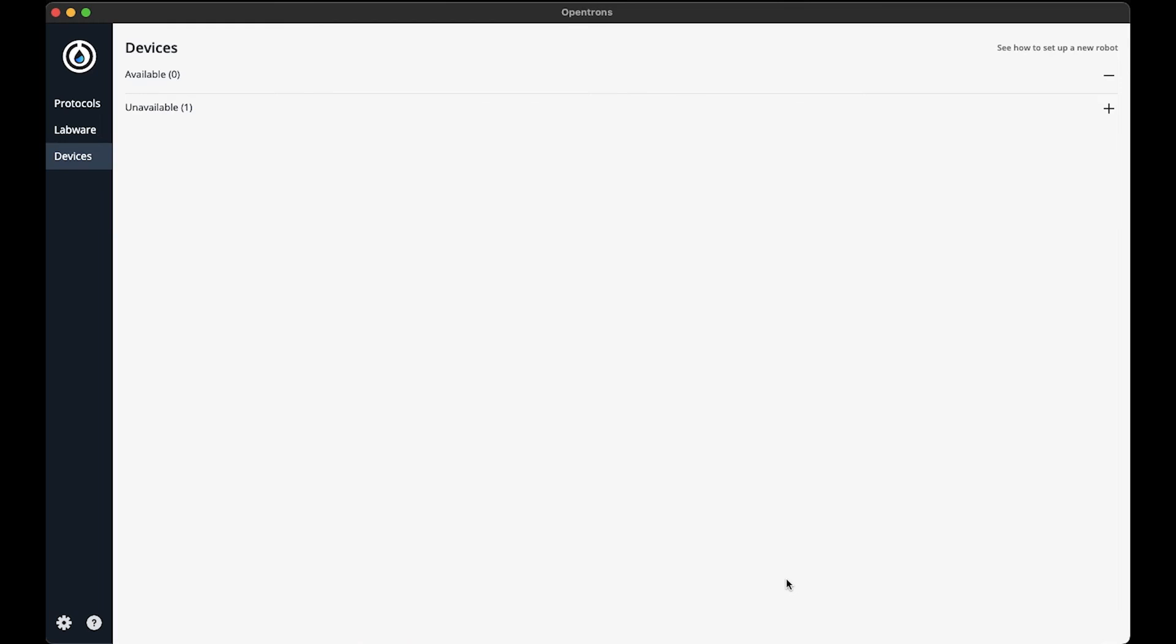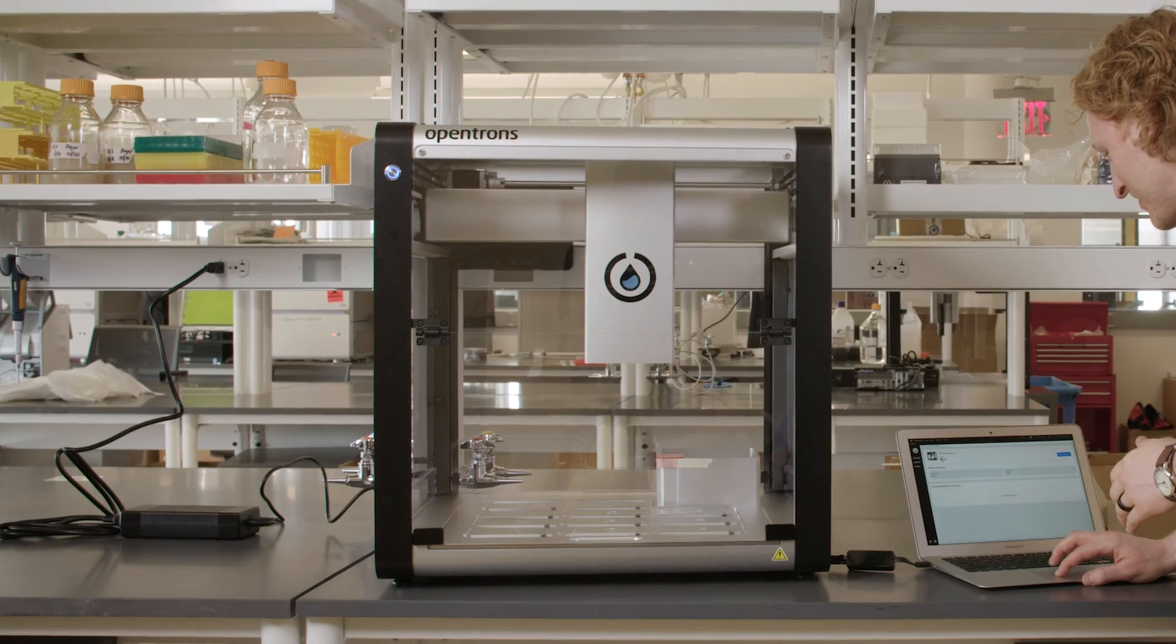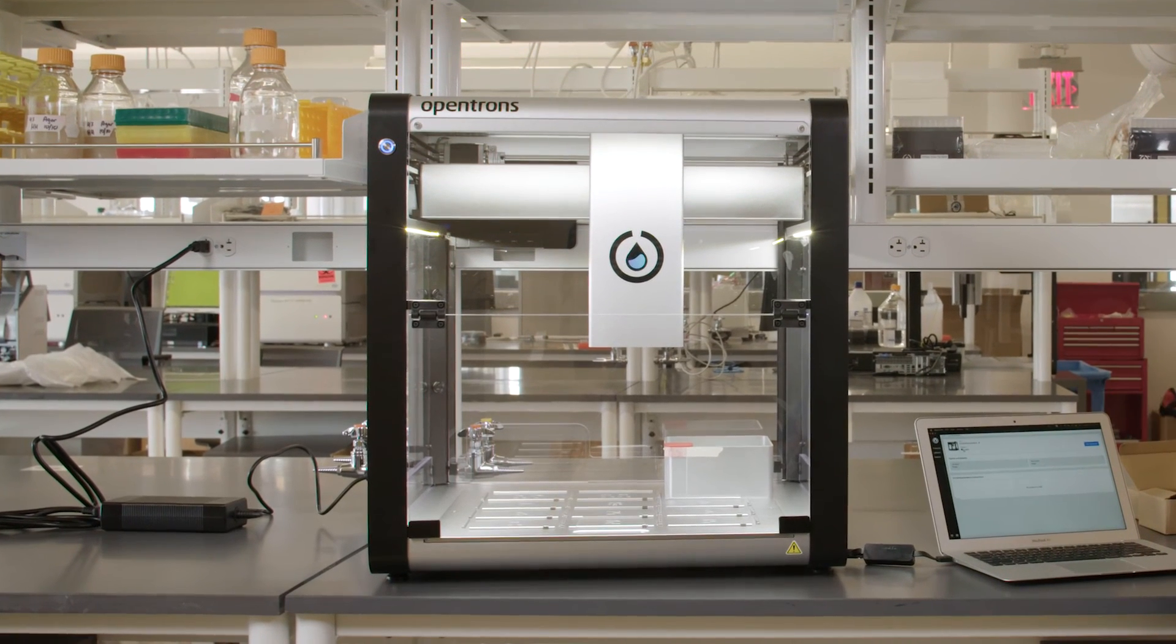Five minutes later. Once the OT2 is updated, there's one cool thing I want to show you. You can turn on the light to see the beautiful robot.